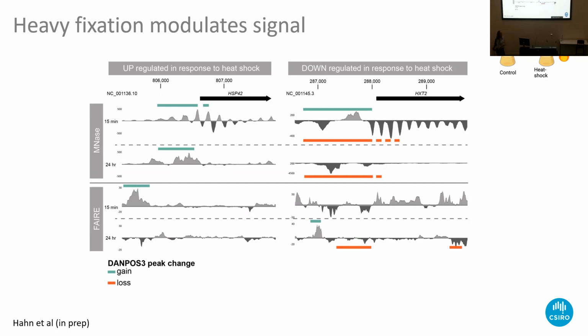So they're still picking up a negative signal, a depletion, but it's much, much stronger in heavily fixed tissues. In our FAIRE assay, here we have a signal of a depletion upstream of this gene. And so even though the fresh sample didn't pick up depletion, FAIRE did. And so there's additional information that is added because of the fixation, rather than eliminating the signal entirely.